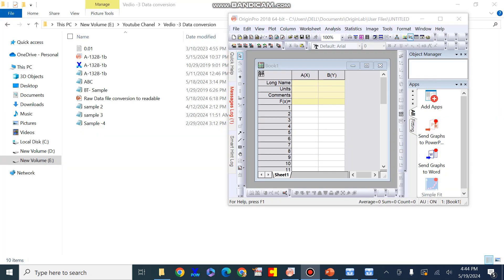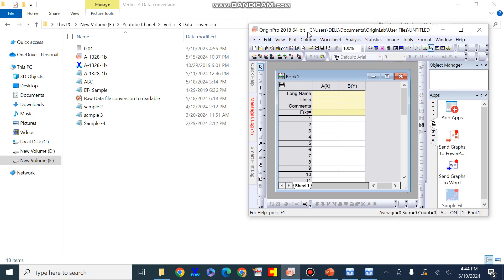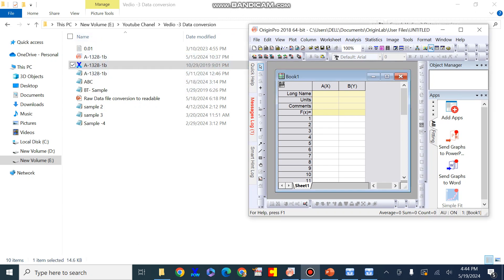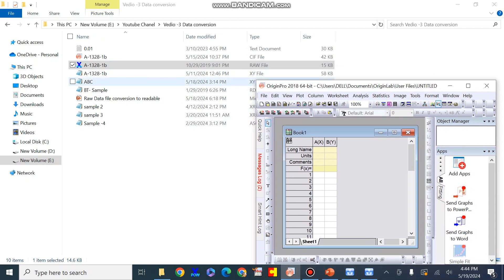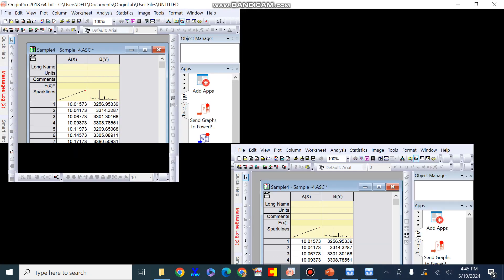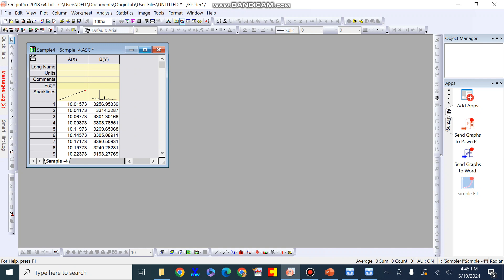Here I will show that we have raw data files in multiple extensions. When I try to plot this raw data file with the help of Origin software, we can see that it is in a non-readable file format for Origin. We need to convert it into a format supported by Origin. I also have a raw data file in the ASC format, and I will show you that this ASC file can be supported by Origin software.